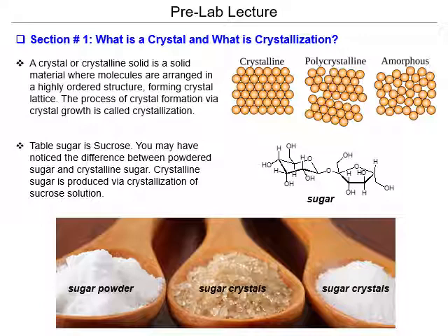Crystals push each other, I guess. You could describe it as that, and how these chains that you can see here, this crystal first forms and then it pushes the other ones to start forming as well, to come out of their solvation sphere. If this was a compound in a liquid solution, then once one crystal forms, it can push the other ones to become more crystalline. They might also be amorphous, but a lot of compounds become like this.